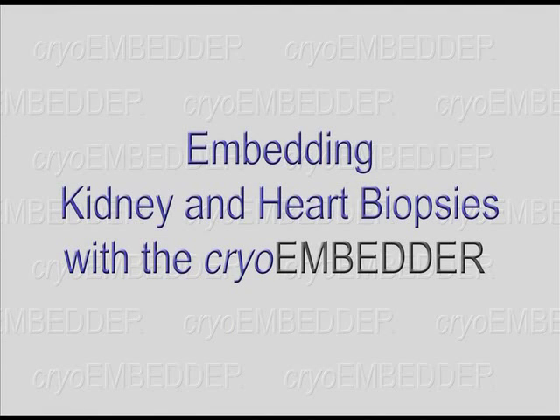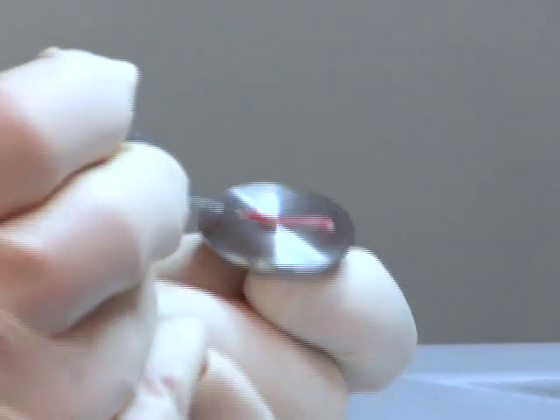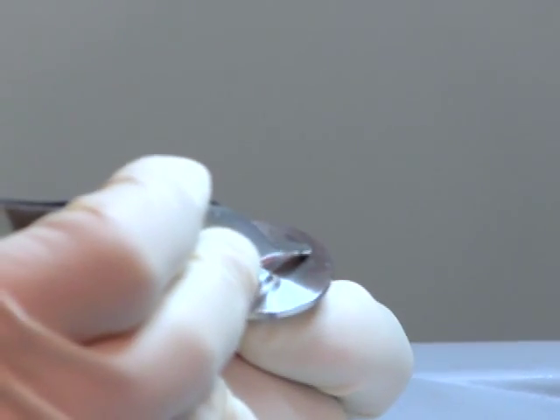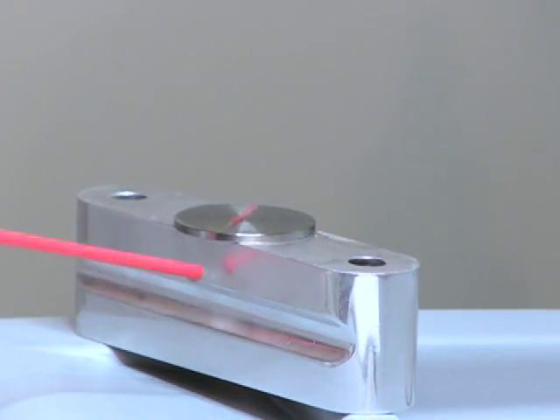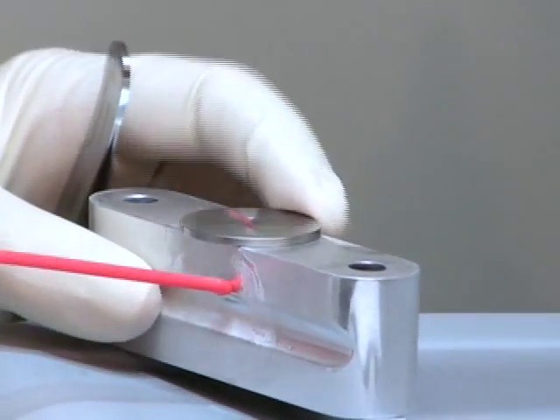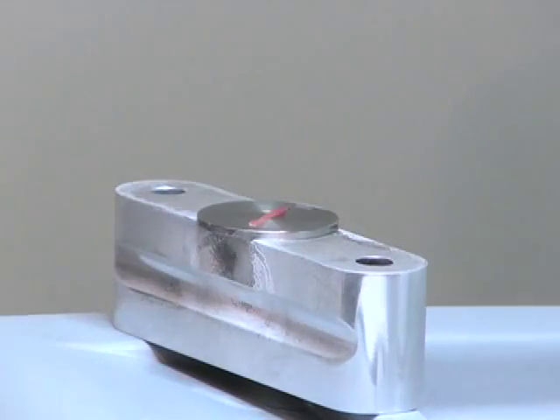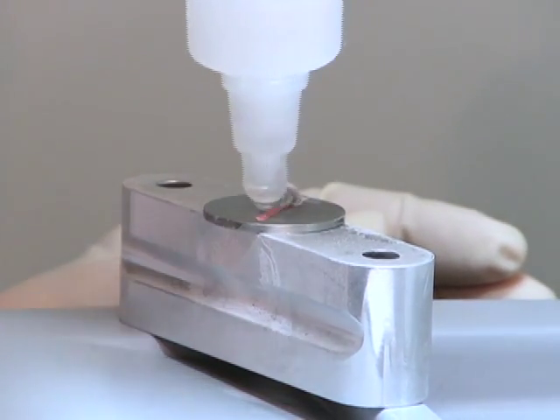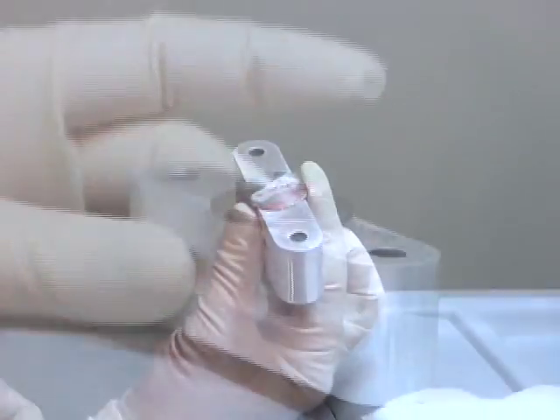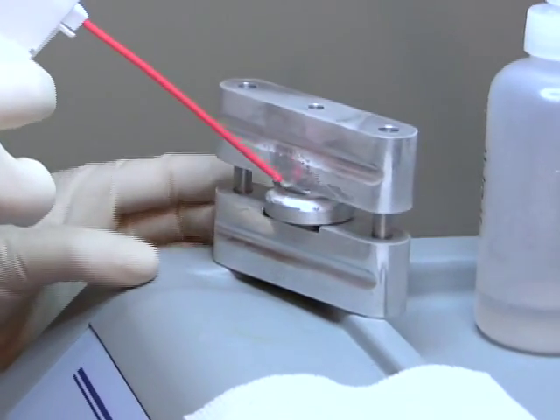The cryoembedder has solved the problems associated with processing needle biopsies. The specimen is placed on the smooth disc and easily manipulated to lay on a flat plane. A technician can consistently cut dozens of full face sections on very small tissue samples without cutting away valuable portions. Because needle biopsies are rarely inked, they can be difficult to see in the embedding medium. By using the cryoembedder, there is no guessing where the specimen is in the block.